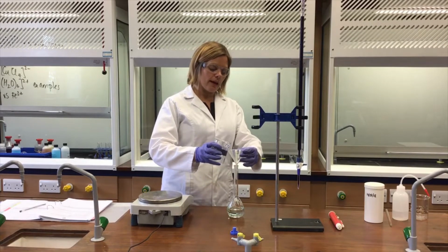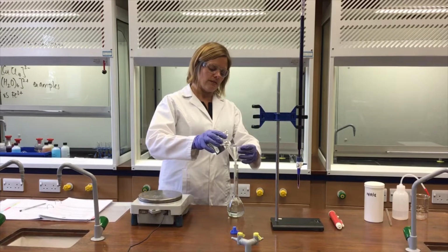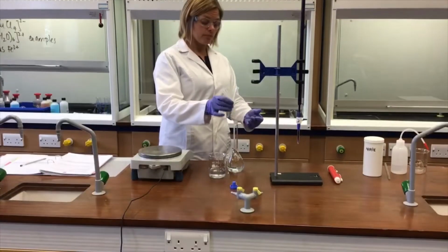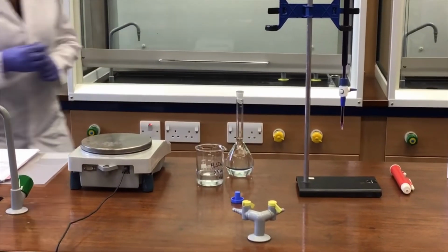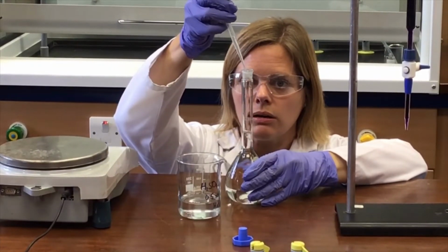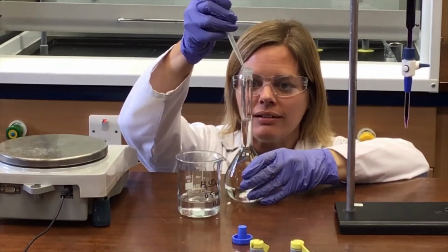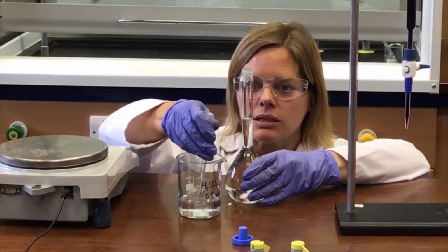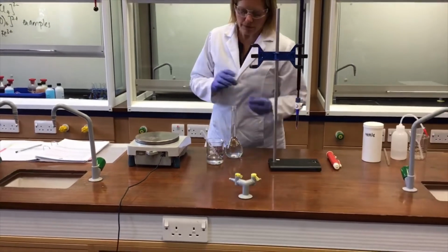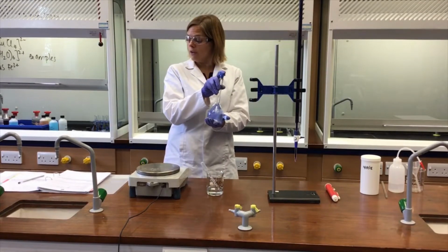I'm going to do that with sulfuric acid for this, and that's a particular feature of this experiment. Normally it'd just be distilled water. In this experiment it's important to acidify, so topping it up like so. I'm topping it up until it just about reaches the neck of the flask, where it's going to move a lot more quickly. Just put that to one side out of the way, and then I'm going to take a dropping pipette to just top that up so that the bottom of the meniscus just sits on the line. So I'm making this up to the graduation mark with sulfuric acid in this example. And the final step is to stopper the flask and invert it several times to make sure that the concentration is the same throughout. That's part one of this experiment done.